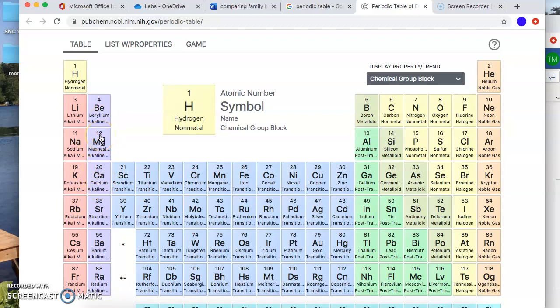So this lab is designed to show you that, and you're going to be looking for this. Now, it's a little bit easier to do in the laboratory because you use the same amount of water and the same amount of metal each time. So we have a constant. I found some videos for you. The problem is from video to video, they're using different amounts of water and different amounts of metal.